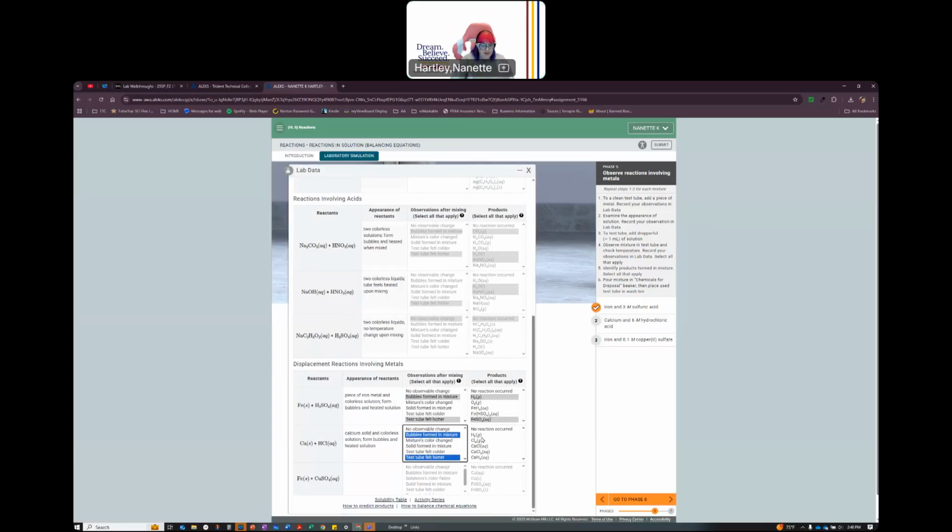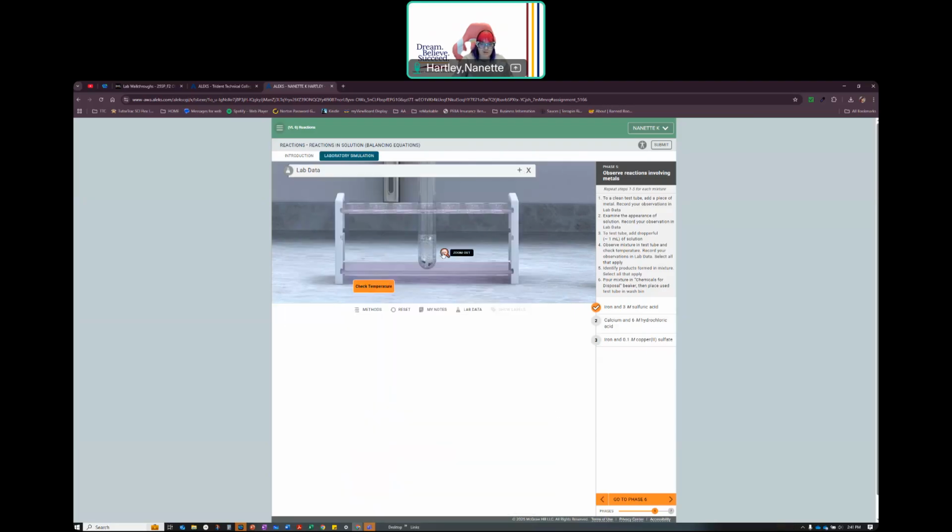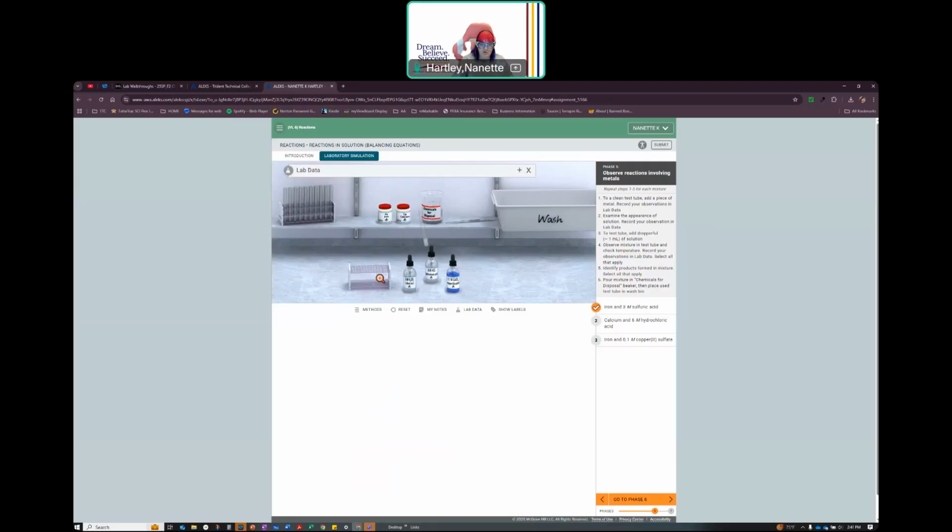And so I'm adding that HCl to it. So I'm making H2 again. And then I've got the CaCl2, because it's the Ca2+ that I'm going to form and Cl that are going to come on that. Minimize this. I'm going to dispose of this and put that up there.